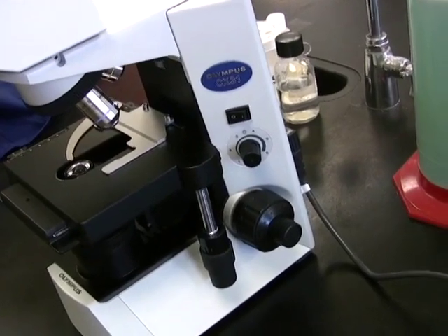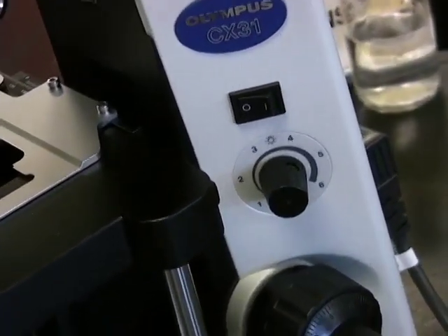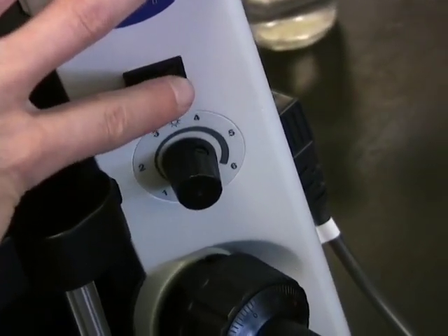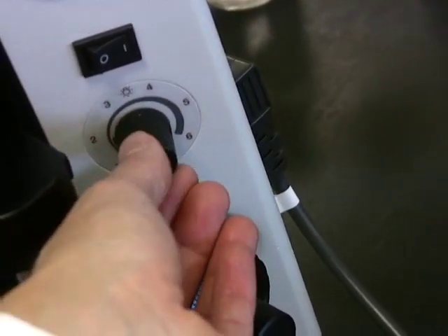On the newer microscopes, the Olympus CX-31, you'll find that the power switch and the knob to adjust the intensity of the light are found on the right-hand side of the arm instead of being found on the base of the microscope.